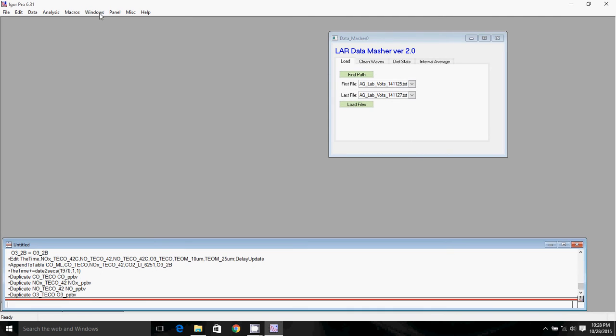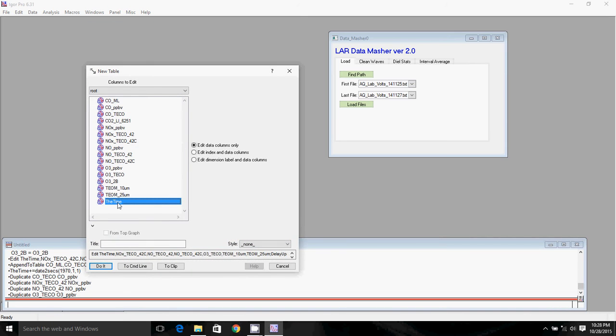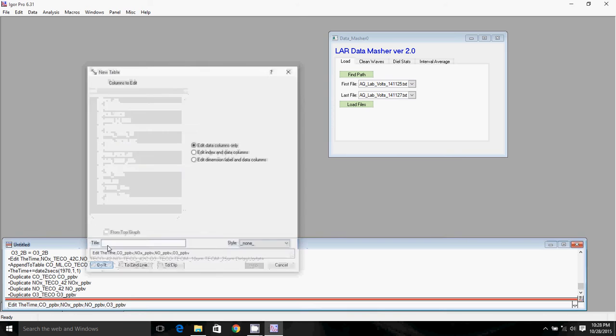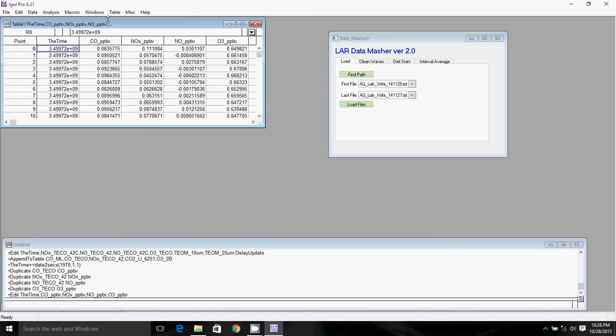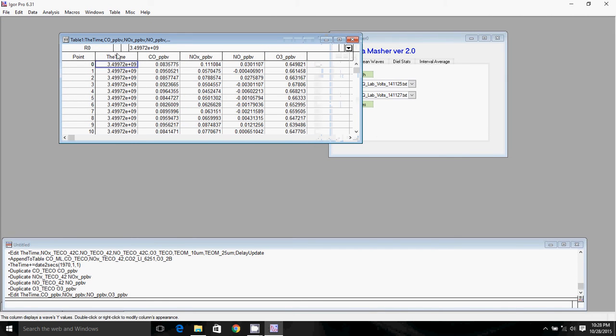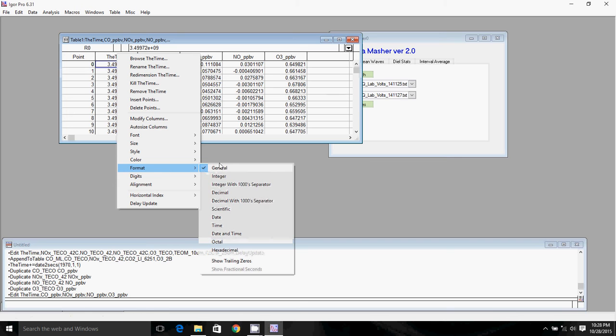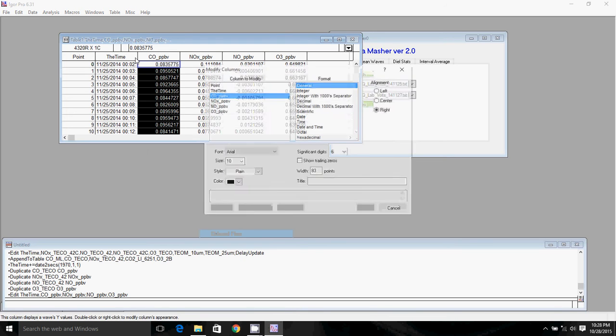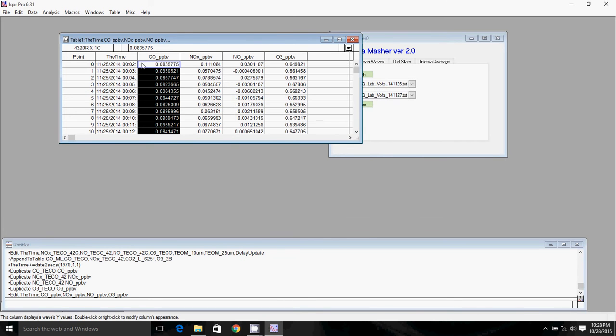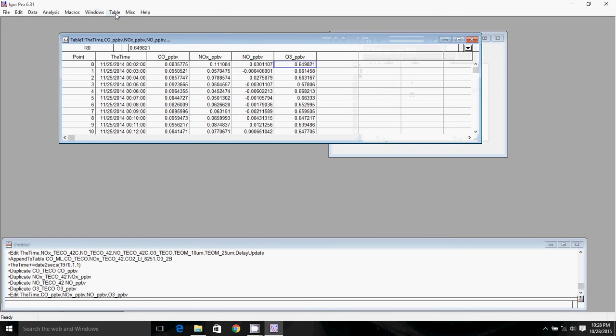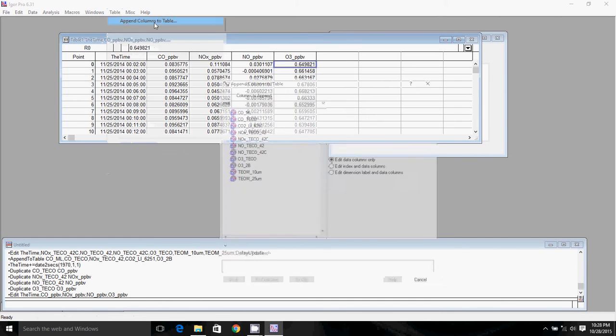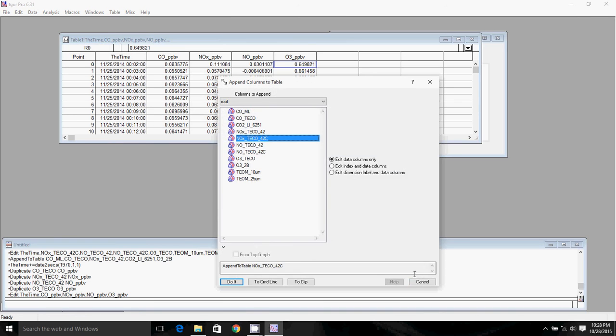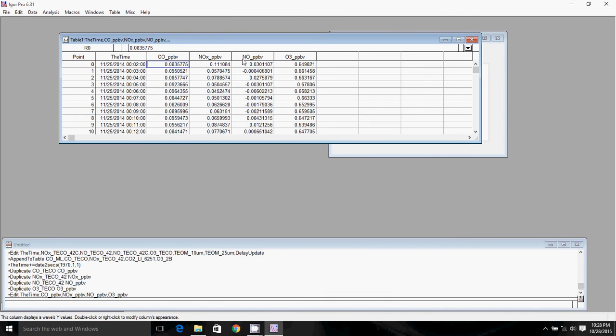And so I'll go ahead and display those in the table along with the time wave. So those are all the waves I made. I was just holding Control to select multiple waves at once. And then I'm going to switch the format to date and time. So again, you can see that time is right. Now if you wanted to add more waves, you could just go to table and append columns to table and select whatever you wanted to put in the table. I'm not going to do that right now.